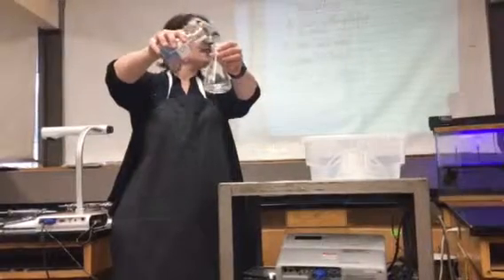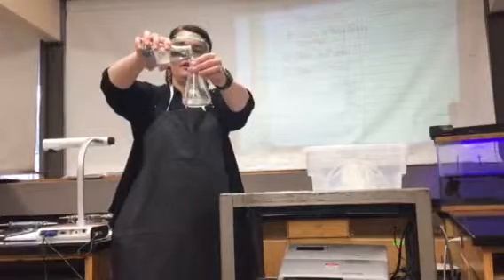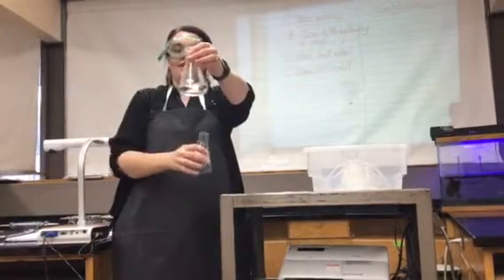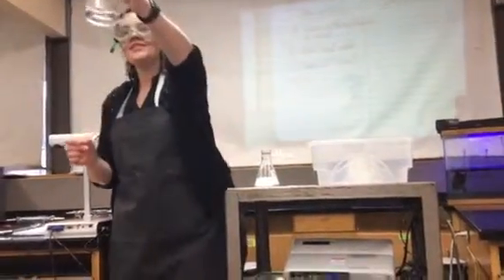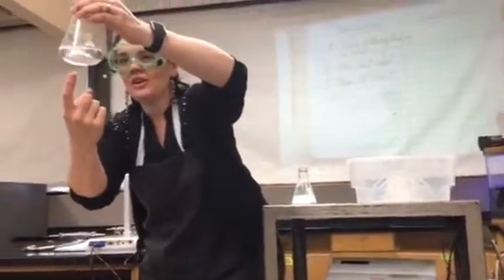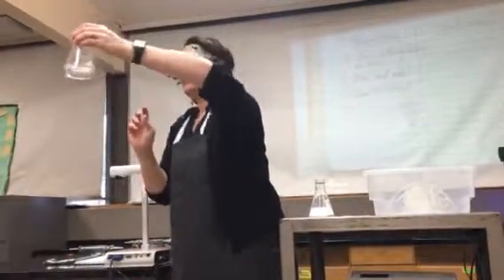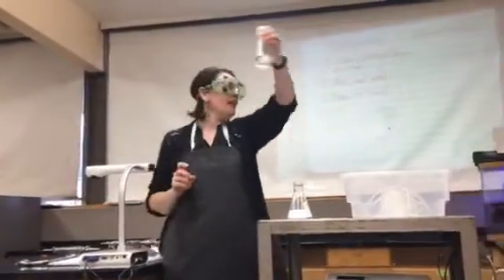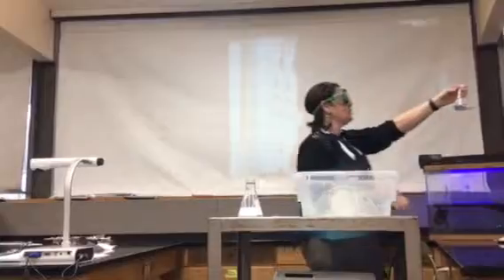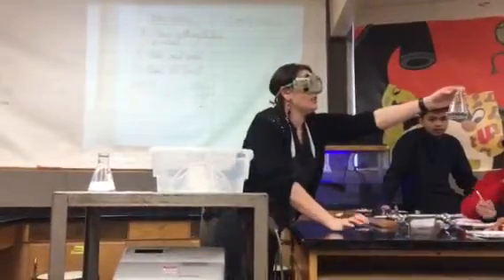Okay, everybody's eyes on this? A and B. I'm just kidding. What happened? Nothing. I do see, have you ever seen when it's not water but it looks kind of thick and syrupy? Like the liquid kind of ripples like that? I did see that. Kind of like oil would look. Only it's still pretty clear looking. Can you see what I'm talking about? It looks kind of heavy. Viscous, like jelly.